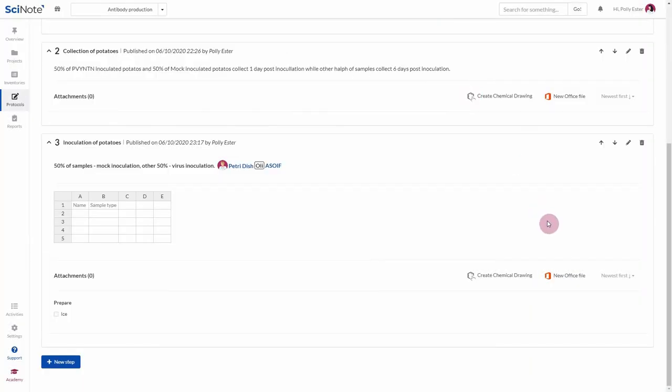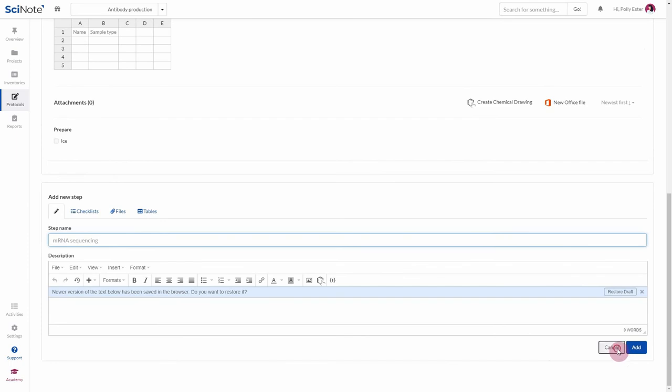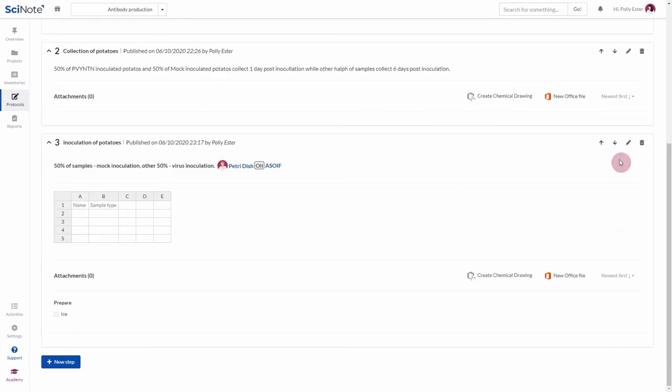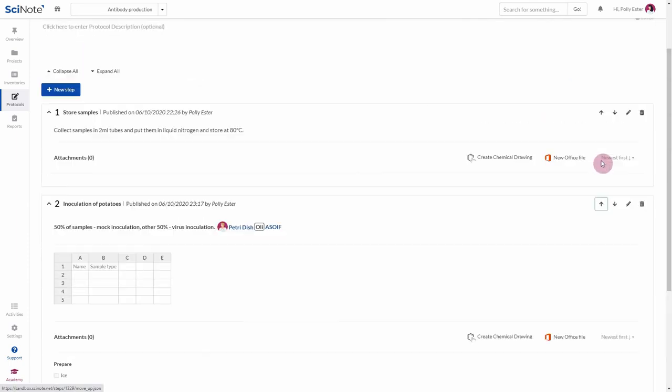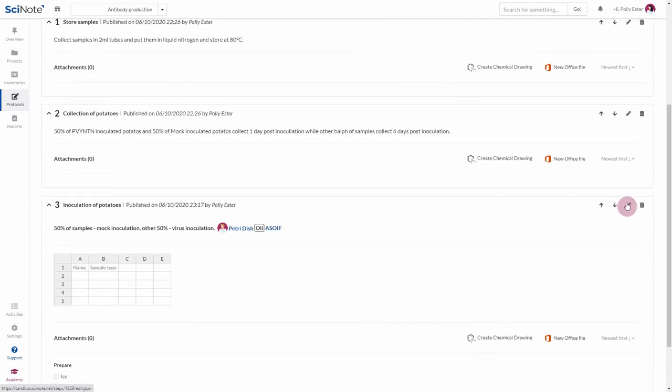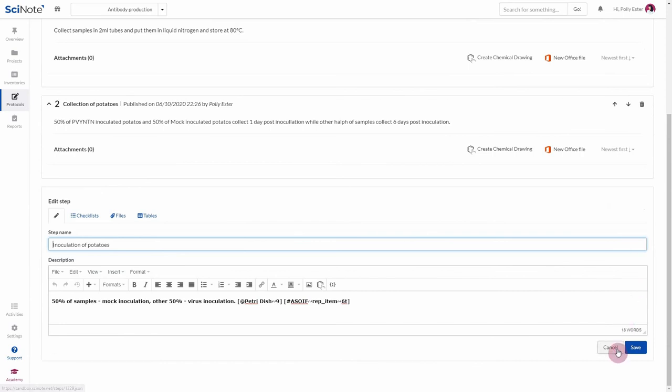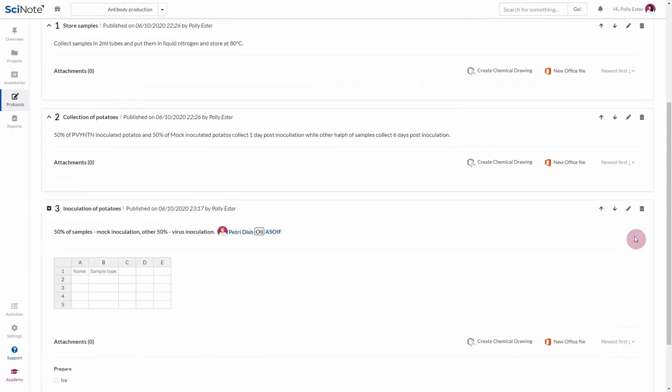You can then continue adding new steps. To change the order of the steps, use these two arrows. You can also go back and edit a step by clicking on the pencil or remove a step by clicking on this trash bin icon.